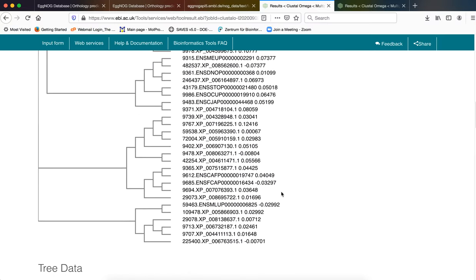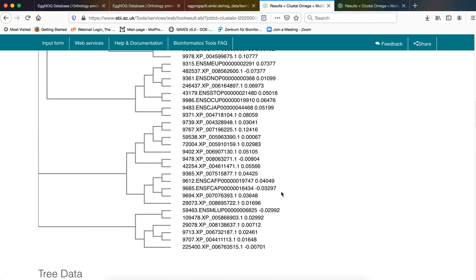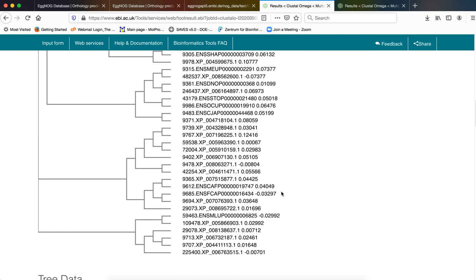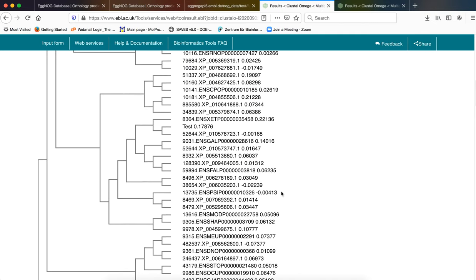And this is our phylogenetic tree which incorporates all the most common orthologous sequences pertaining to our test sequence. See our test sequence is also finding a place in one of the, as part of one of the sister nodes that are provided here.